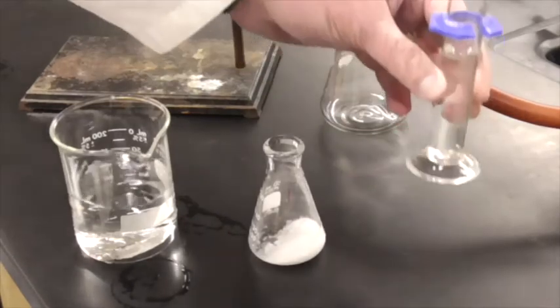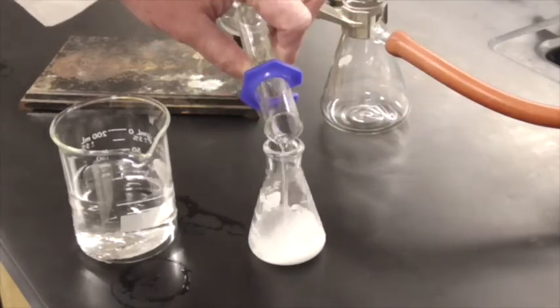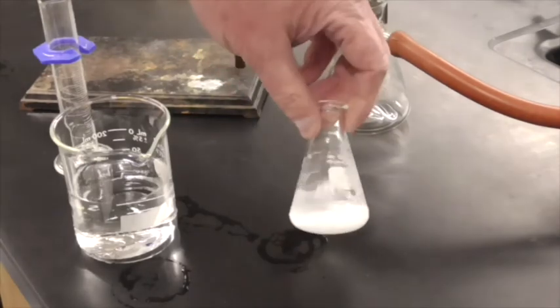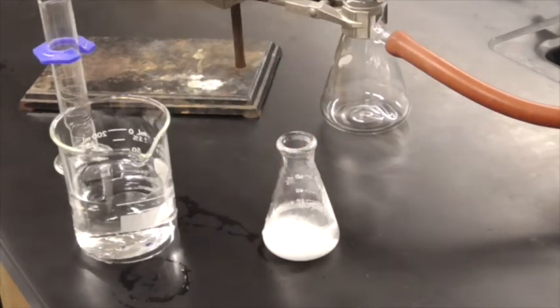So it's about 20 milliliters. And now I'm going to add that to our aspirin, or our product. I'm going to swirl it around a little bit to see if I can break that up. Okay, I'm going to grab a stir rod to try to break that up in there, and then we're going to filter it.